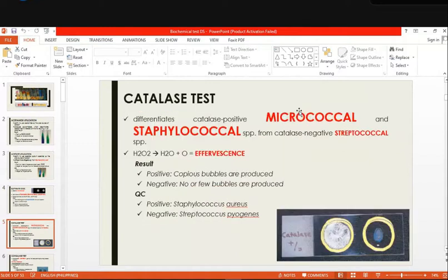Here with our catalase test. Alam na natin, ano ba si catalase? So, saan yung unang narinig si catalase? The breakdown of hydrogen peroxide into water and oxygen. When we were talking about what? Your anaerobes or your aerobes, diba? So, we all know now that catalase is an essential enzyme in pathogenic organisms.